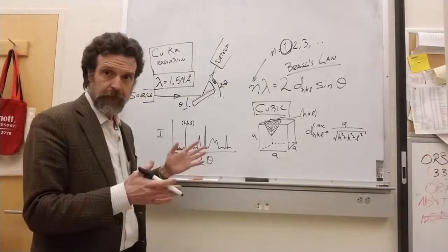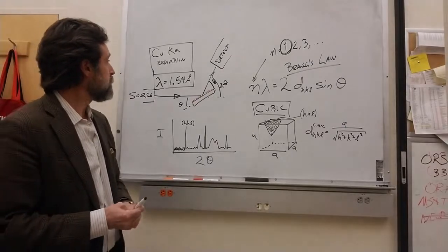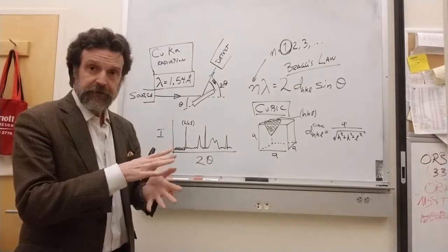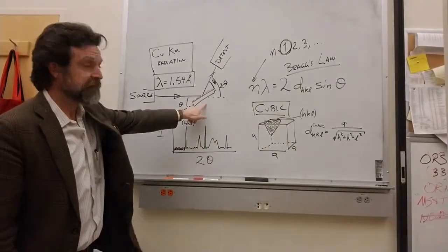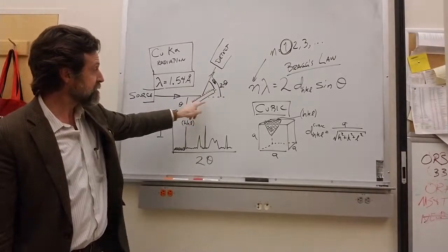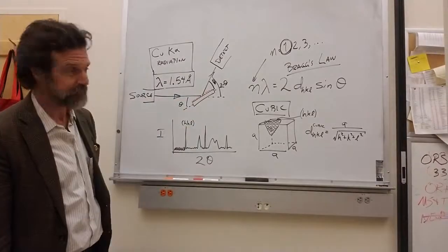Let's review X-ray diffraction. In X-ray diffraction, you have your sample, you grind it up into a fine powder, you put the powder on a stage, and the stage goes into a diffractometer. So this is the stage, and I drew our powder, this little red dust.